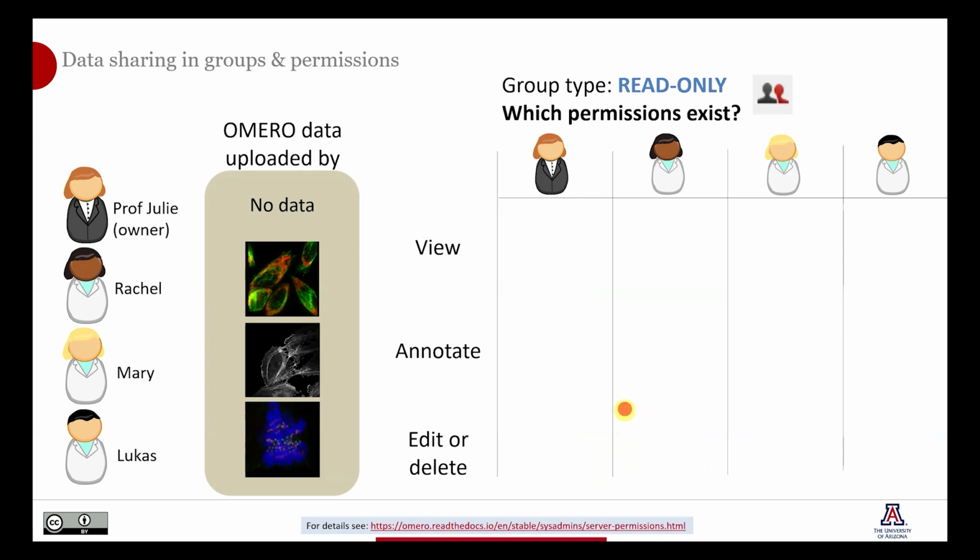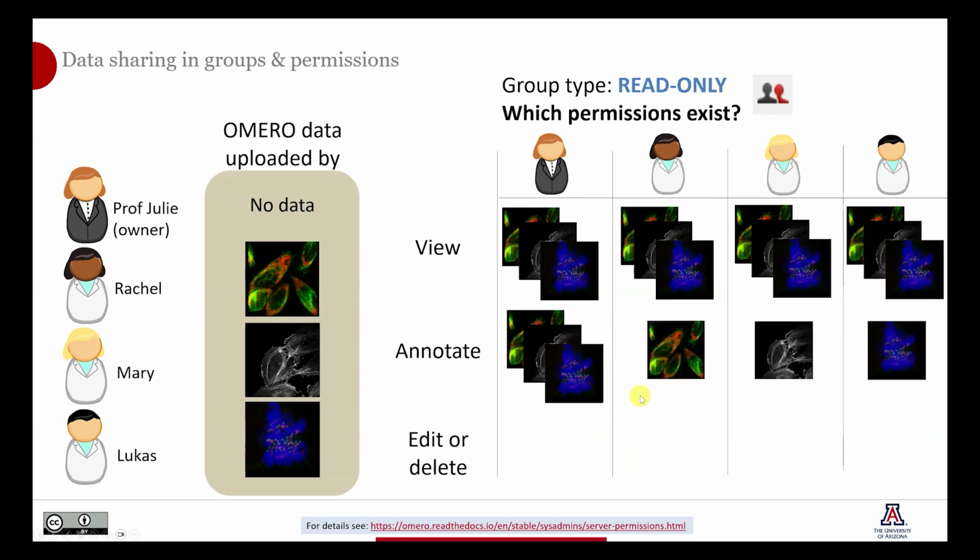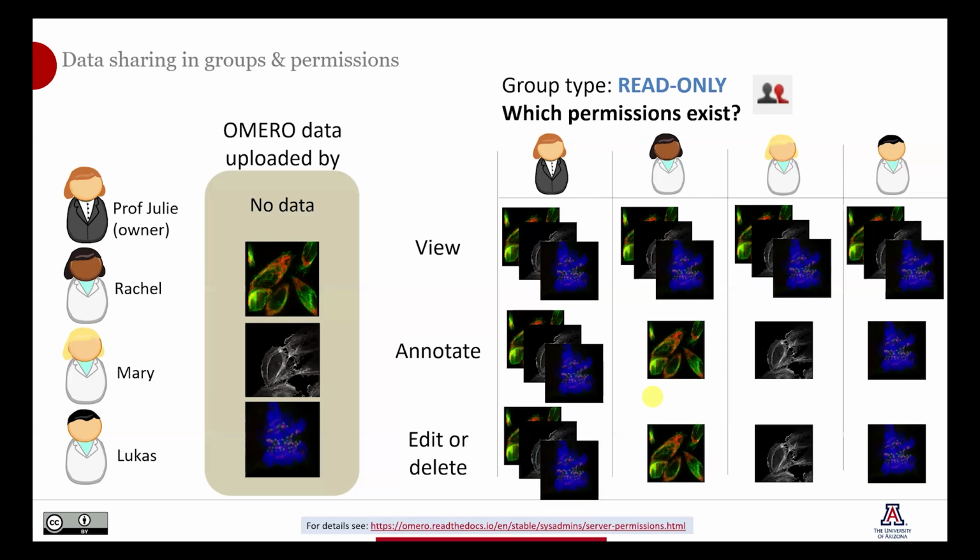In read-only, everyone can see all the data, but they can only annotate the data that they've uploaded. Professor Julie can now annotate any of the data, and Professor Julie can edit or delete data, and the individual users can edit or delete the data that they have uploaded.